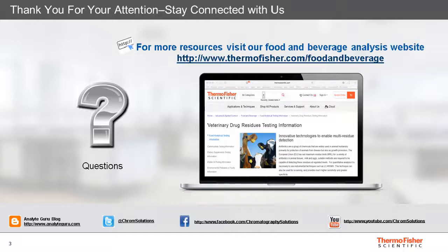chloride, nitrate, nitrite, phosphates, sulfates in water. In terms of matrices, just to quote some of them, nitrites and nitrates in meat products and vegetables, organic acids, especially oxalic acid in honey, acid contaminants in food packaging, just to mention a few others, bromate in bread, acetic acid in environmental samples, speciation of metals, but of course we will need to have an ICP-MS, and many more.